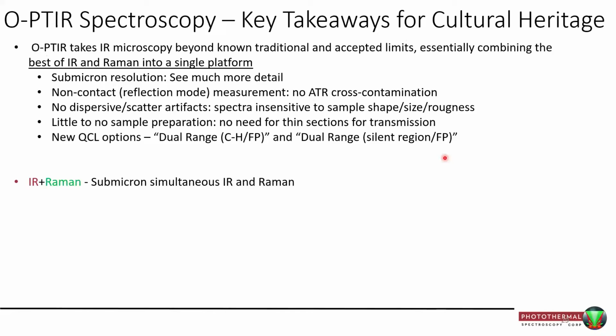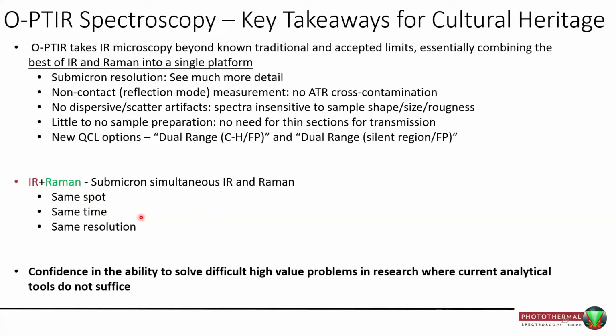I'm going to finish up by again reminding you of IR plus Raman, giving us the same spot, same time, same submicron resolution measurements. And with that, I'm going to hand over to Victoria. Thank you, Victoria, take it away.